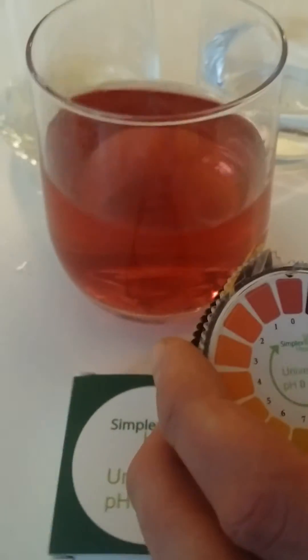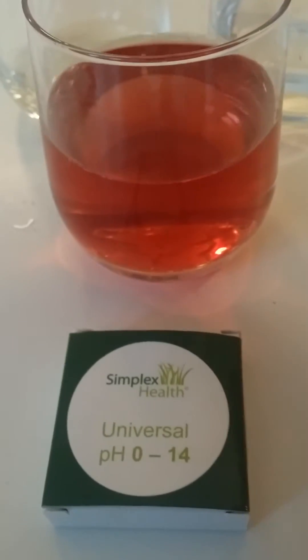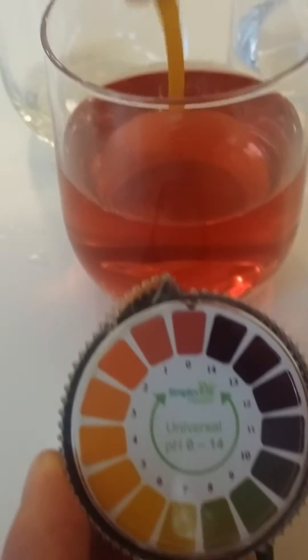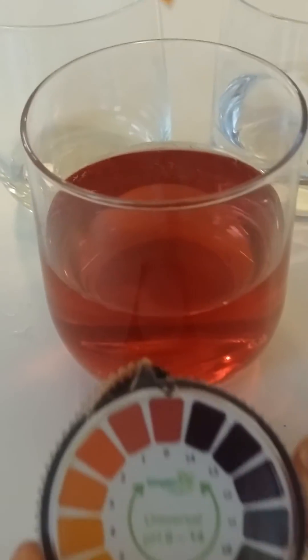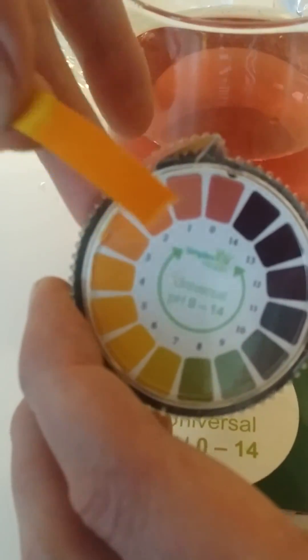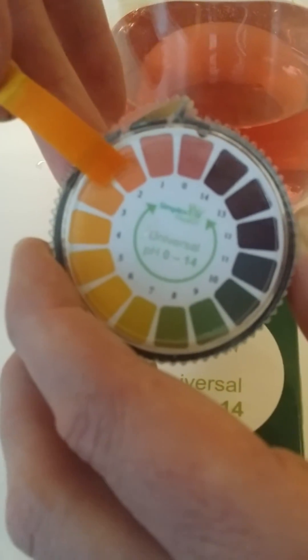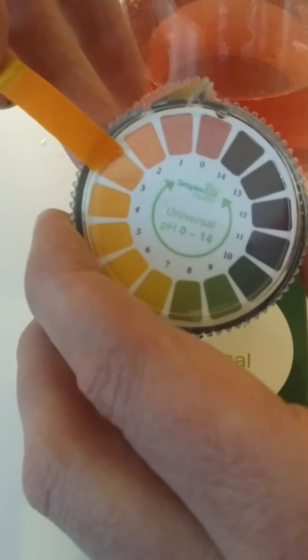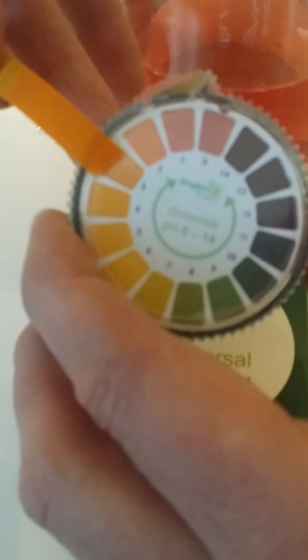The next solution we're going to do is a cordial. Again, this one here you'll find it'll have a low pH as well. You dip it in the water, take it out, wait a few seconds, match it against the chart, and this particular one here the strip has gone a little bit darker.